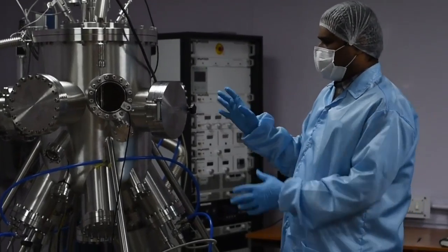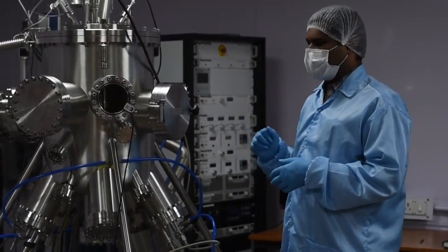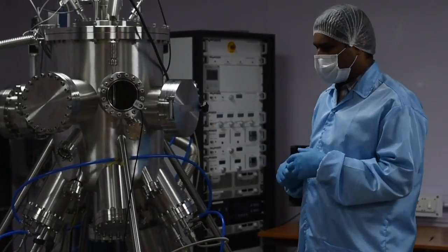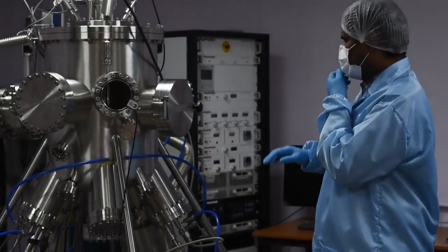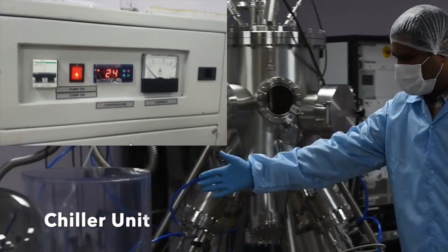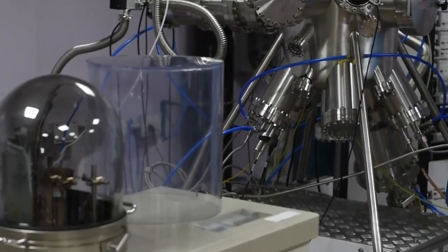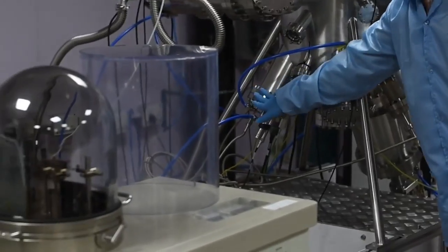This process happens under high vacuum conditions, on the order of 10 to the power of minus 6 mbar. This is the vacuum chamber unit of the sputtering system, this is the control unit, and that is the chiller unit. In this sputtering system we can perform DC sputtering and RF sputtering.